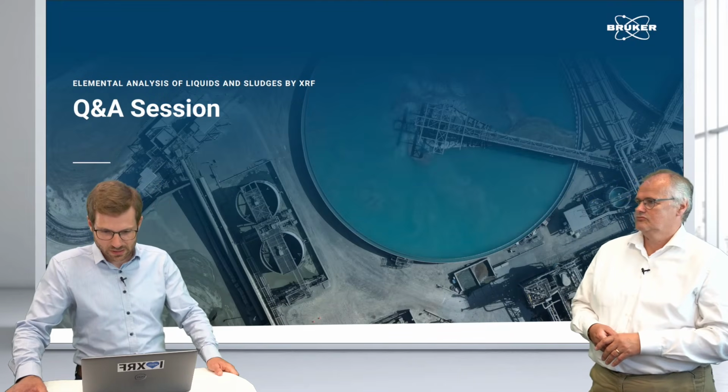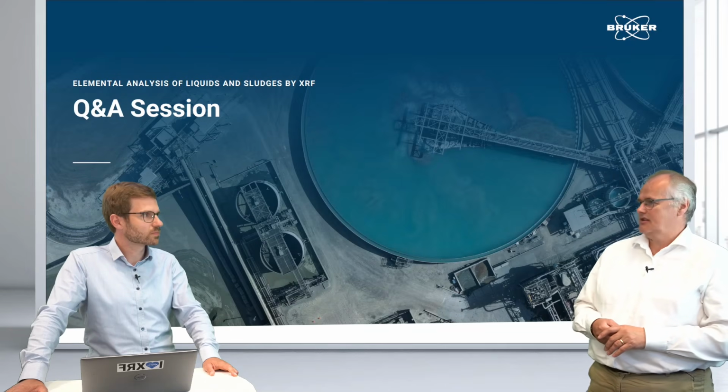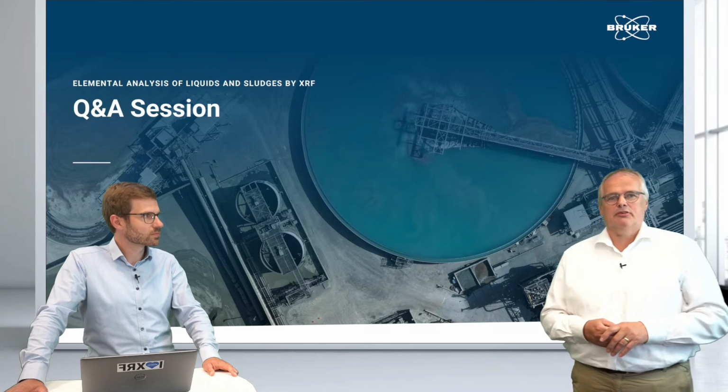Thank you, Kai. Another question is, we are operating a copper mine and we're looking into drill cuttings. How would we prepare these samples, and which device do we need for this application? Yeah, and I've seen a lot of customers who are simply using liquid cups. Actually, you can use a handheld instrument, of course, a handheld XRF from Bruker, for example, or you can use a liquid cup and place the drill cuttings directly in the liquid cup, and typically the results are good enough, right? Yeah.